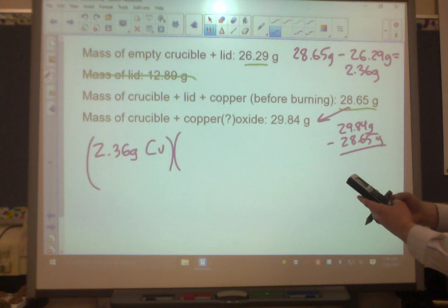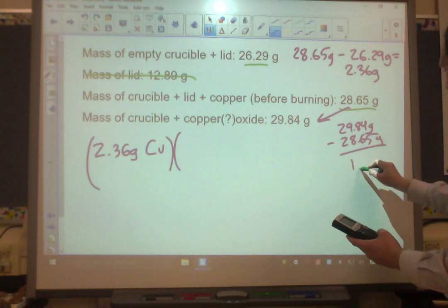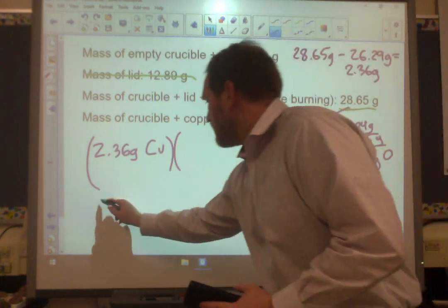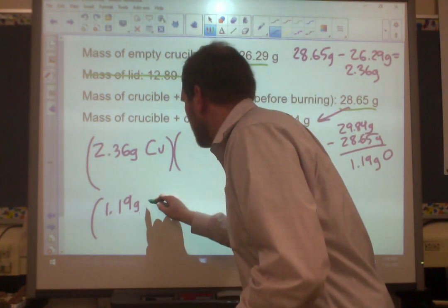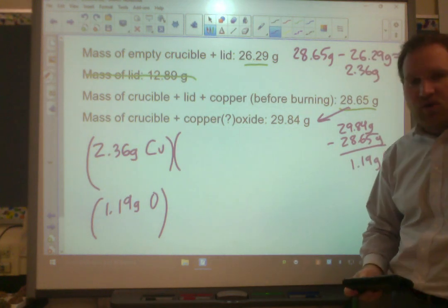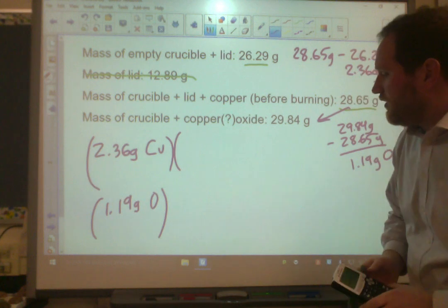29.84 minus 28.65 gives us 1.19 grams, and that's going to be our mass of oxygen. 1.19 grams of oxygen. Why don't you take it from here, solve this out, pause the video, see if you can work out the empirical formula. All right, I'll finish it out here.